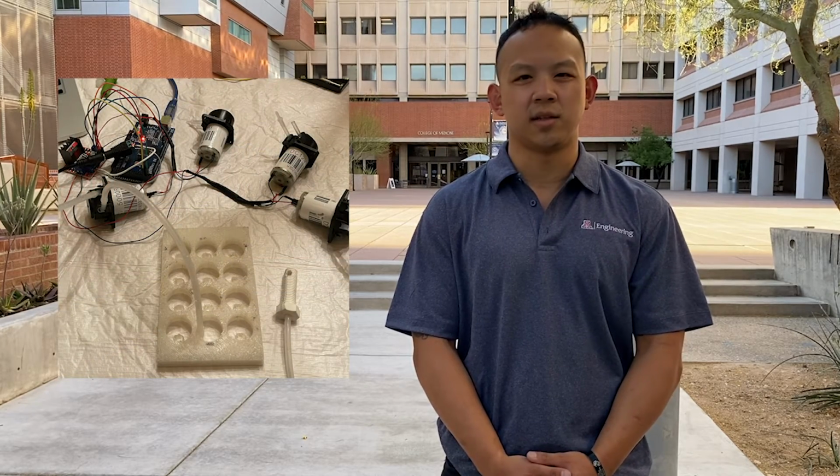Using prototype components allowed us to perform initial testing to ensure that our system would work and perform as expected. After all of our custom components were tested, final versions could then be manufactured and integration assembly could be completed.